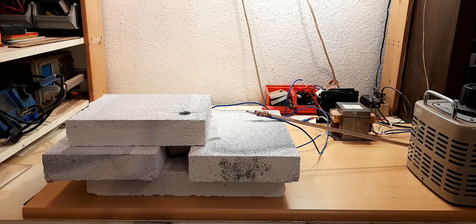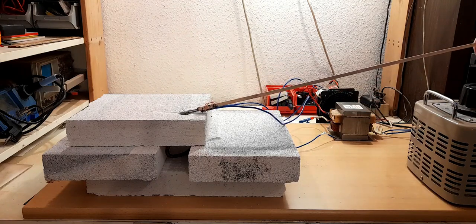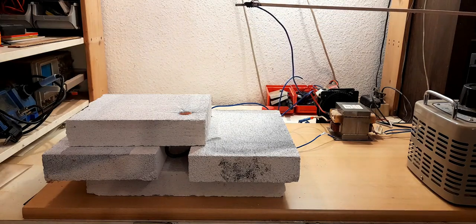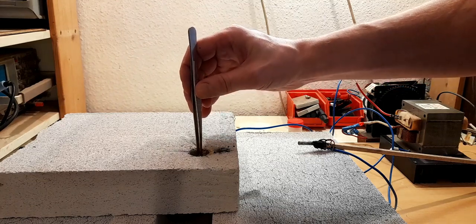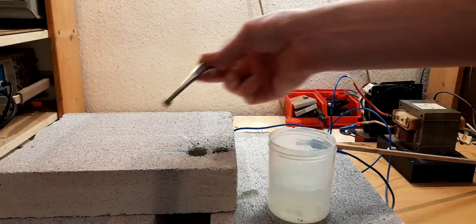We turn the voltage up to 1200 volts and then bring the electrodes close together to form an arc. This will melt the mixture. We wait until it's cool, then we remove the ruby with a pair of tweezers and clean it with water and a brush. Our first synthetic ruby is done.